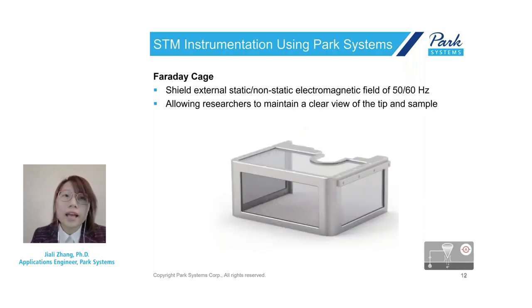To shield against a static or non-static electromagnetic field of 50 to 60 Hz, you can also assemble the Faraday cage.